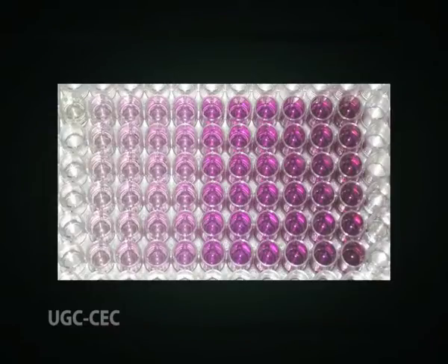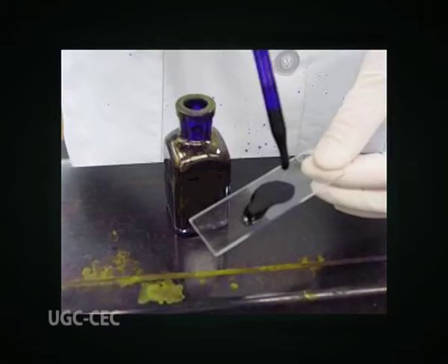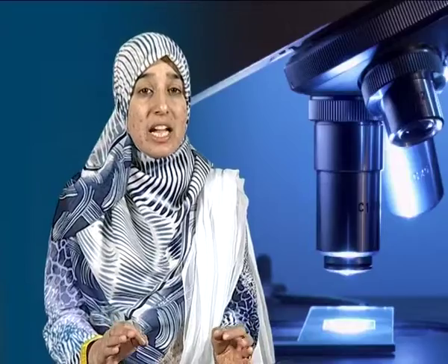The third type is dye reduction. Dye reduction techniques are used to estimate the number of viable cells that possess reducing capacities. Two dyes commonly employed in this procedure to estimate the number of viable organisms in suitable products are methylene blue and resazurin. To conduct a dye reduction test, properly prepared supernatants of foods are added to standard solutions of either dye, for reduction from blue to white for methylene blue and from slate blue to pink or white for resazurin. The time for dye reduction to occur is inversely proportional to the number of organisms in the sample.